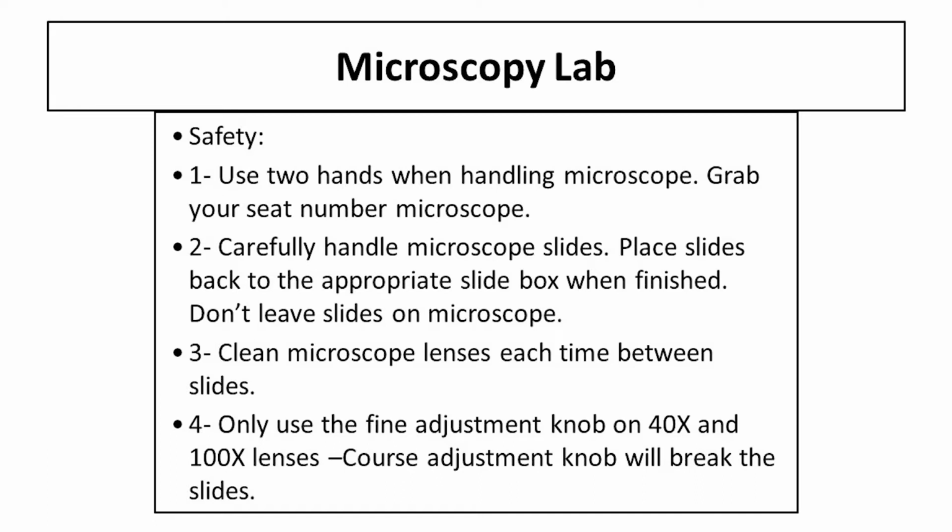Also with the slides, be very careful with them. Some of them are finicky and old. They're also all made of glass, so if you break them, they can cut you. So be very careful. Make sure you also place them back in the same box that they belong in. Don't just take random slides. Make sure you put them back in the same exact spot and nice and evenly so that we can keep everything nice and tidy.